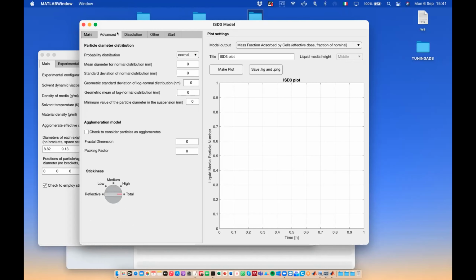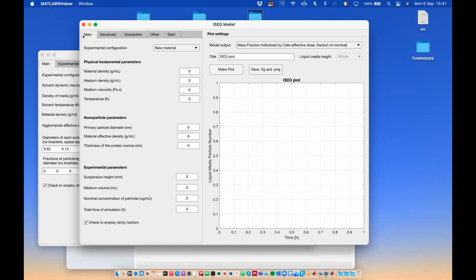Yes, basically you can create your own input file when simulating for the first time a specific configuration. So Pietro has just changed the option to new material. And when you select new material, as said by Professor Alwalia, you can manually insert, manually fill the blanks and insert your parameters you characterize for your setup.